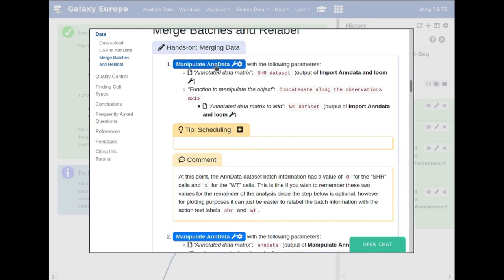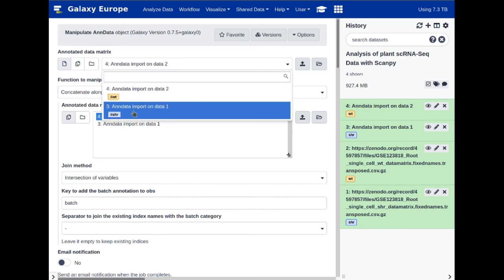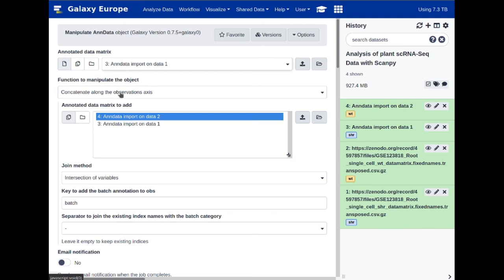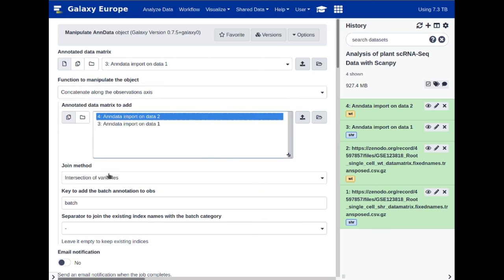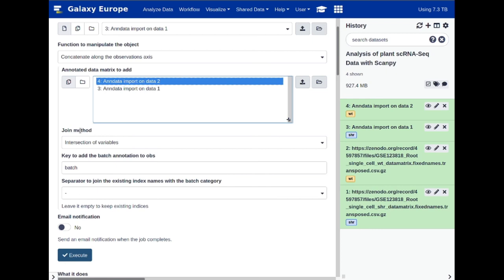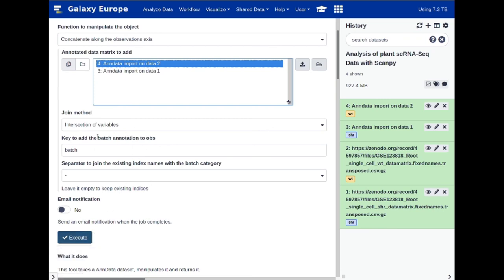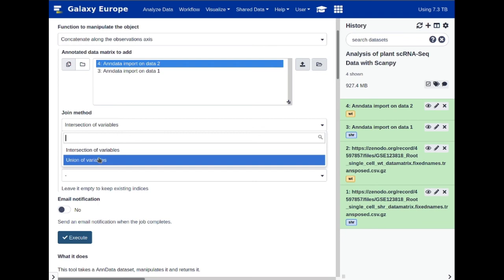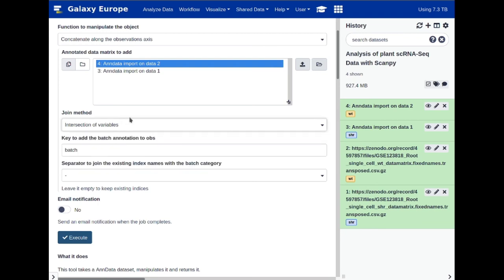We're going to concatenate along the observation axis, adding the wild type onto the SHR as the input. Click on 'Manipulate AnnData', choose the SHR dataset as the input, set the operation to concatenate along the observation axis, and select the wild type dataset. The join method is not critically relevant here because these datasets have the exact same set of variables. However, if you're doing a batch merge in the future, you may want to consider using a union of variables rather than an intersection to get a wider scope of variables that could be driving the analysis.